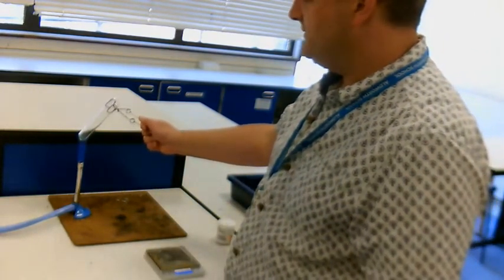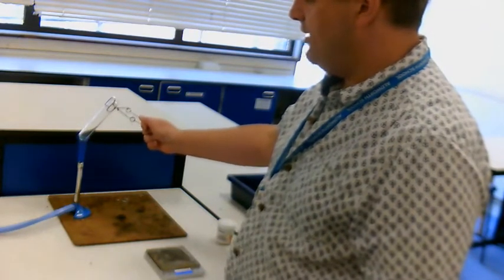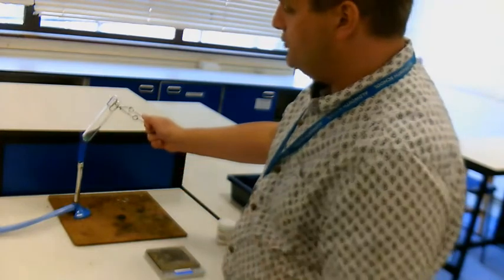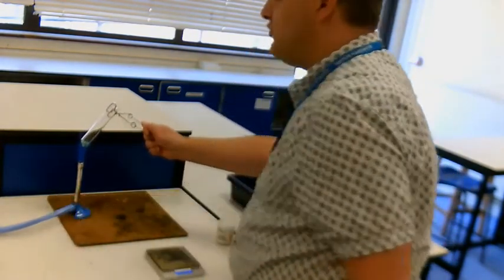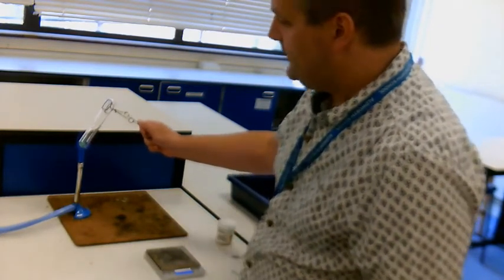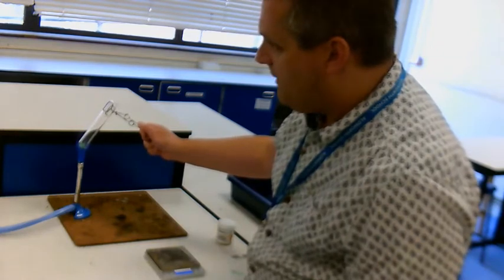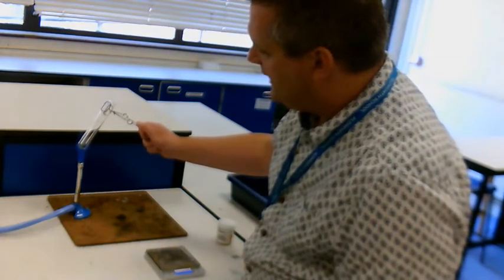Might take a few seconds. So that will be thermally decomposing. If you ever see a chemical with that really bright green colour, that's normally telling you that there is some copper in there, because copper ions have that lovely green colour. So it's starting to go just now. I'll move the camera a second, but it is quite quickly changing colour.